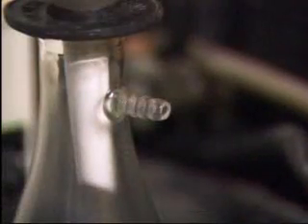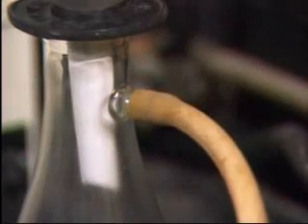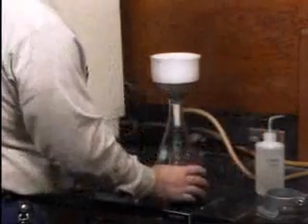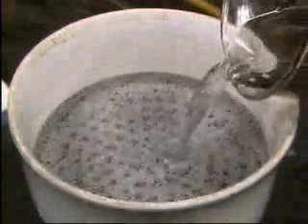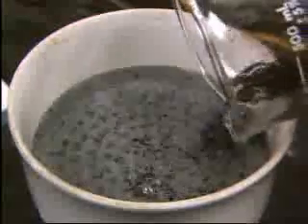Then a rubber tube connected to an aspirator is attached to the funnel assembly. The aspirator is used to help draw the sample liquid through the filter paper. Now the technician is ready to filter the solids out of the sample. First, the sample is poured into the funnel. The liquid passes through the filter paper, and the solids remain trapped on the paper's surface.